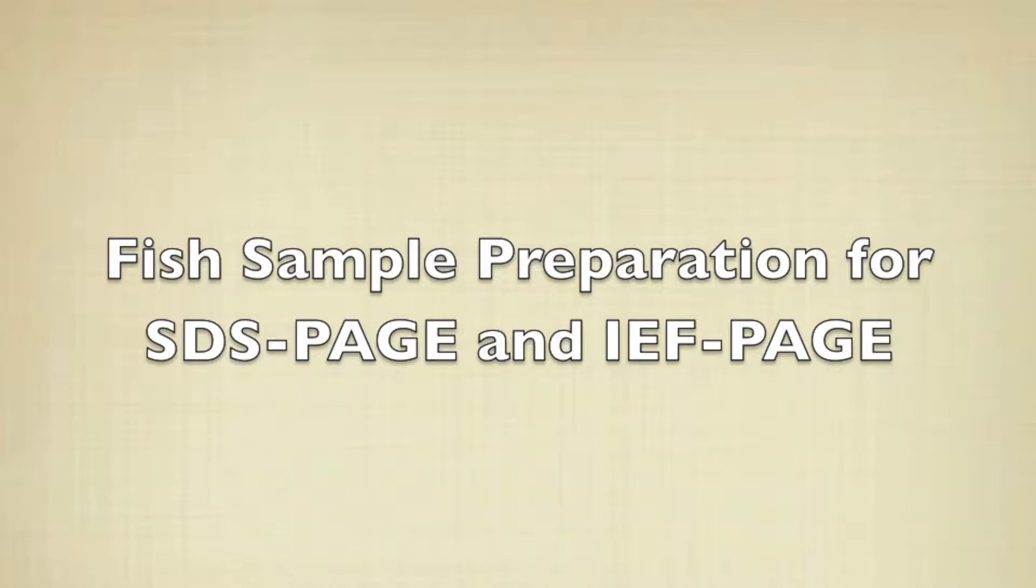This video will demonstrate sample preparation for SDS and IEF page.